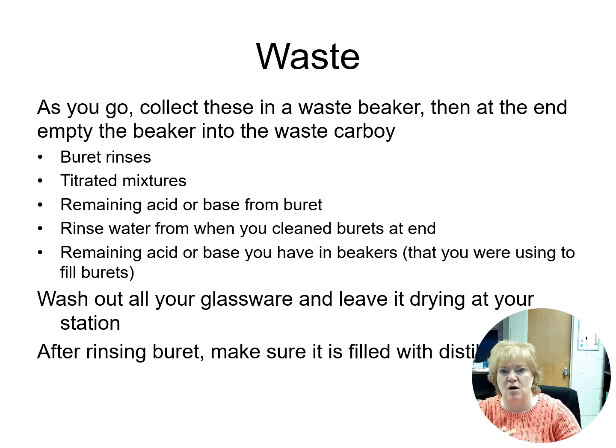You can just pour it all into one beaker from all your containers, dump it in the waste, wash out all your glassware, and leave it drying. After you rinse the burette with water, then make sure you fill it with distilled water. You want to leave it filled with water so that dust can't stick on the insides. I'll see you in lab.